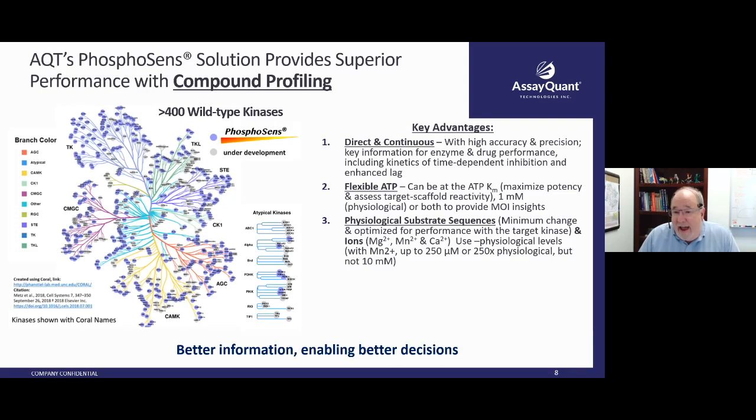We've got it validated to a certain degree already, but will we be able to get this going within the next month or two? Probably not. But we're hoping that by year's end, or hopefully even by the fall, we'll be able to start making some improvements to our kinome profiling system such that we'll be able to do those 1536 well plates there.